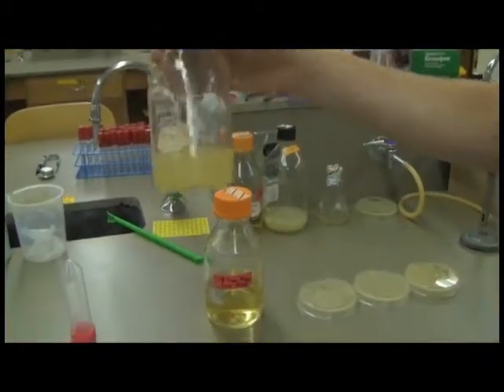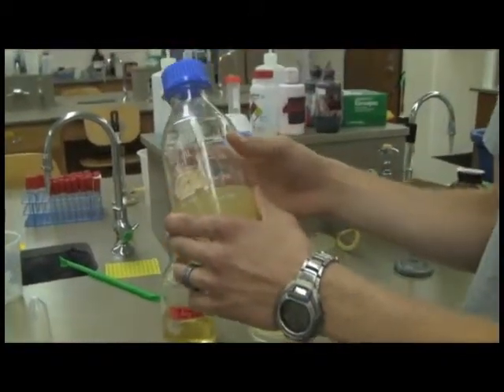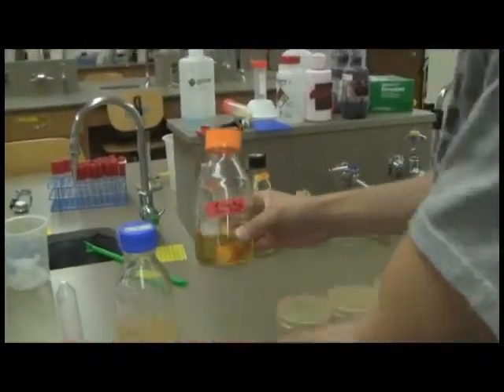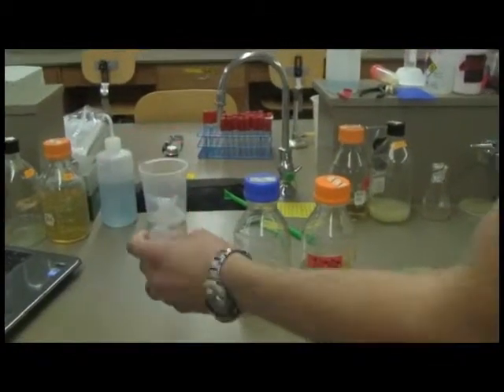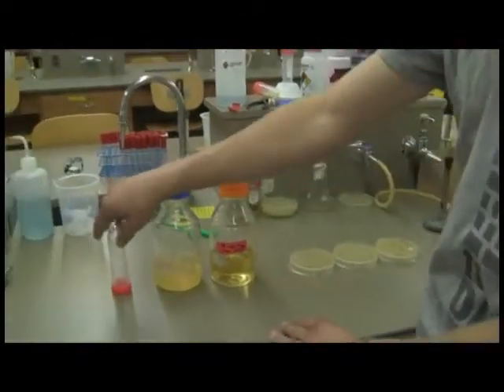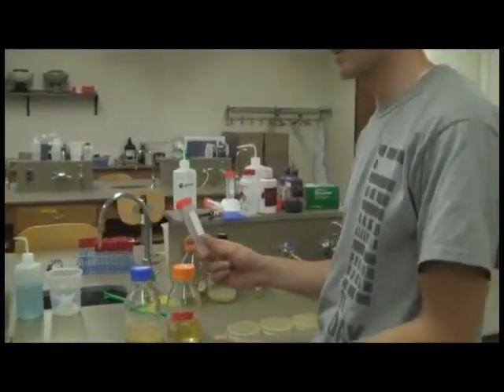Not only does this store well, but when we are ready to use it, we can melt it in the microwave and then it becomes liquid, but it's too hot to use. But since it's twice the concentration, we'll mix it 1-to-1 with typical liquid broth media, and we'll do it in a 50 milliliter test tube that's sterile, or you can use a sterile flask or beaker or jar. And then the top agar will be closer to room temperature and better to use. It won't kill your bacteria.